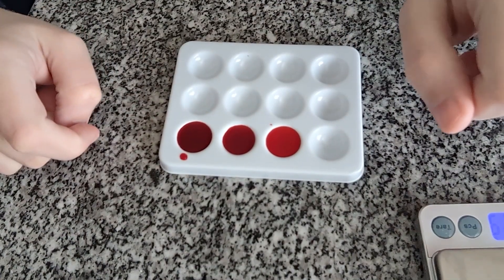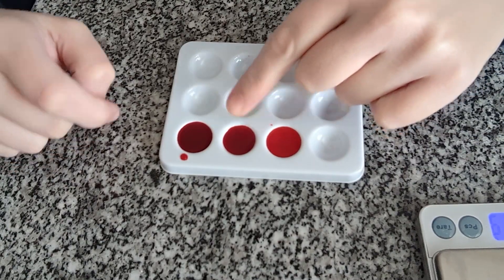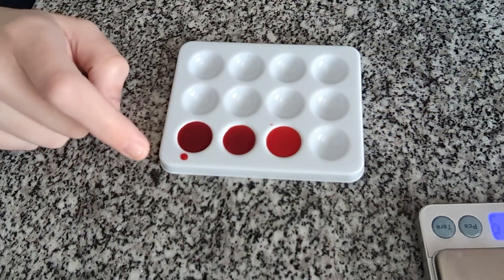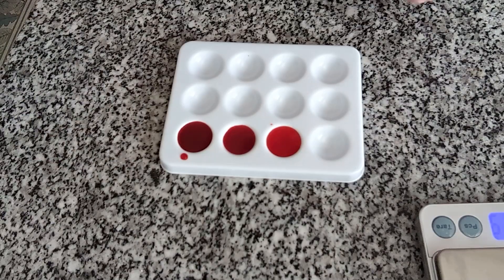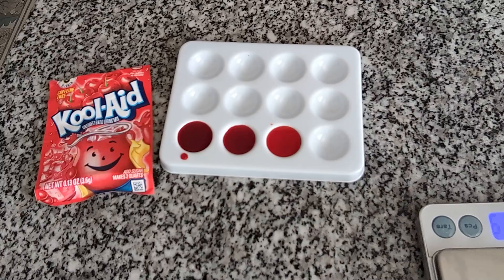Okay, right here you can see the three samples side by side. This is the 0.25, that is the 0.5, and that is the one. Again, I promise this is Kool-Aid. Maybe we should put that side by side so you can see.